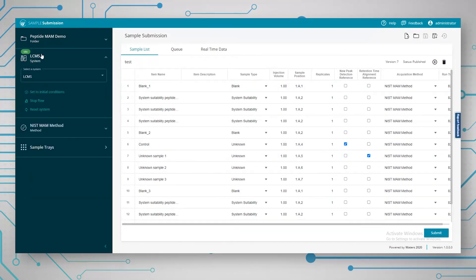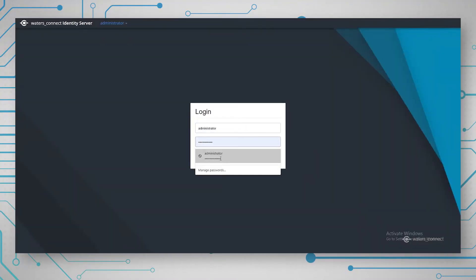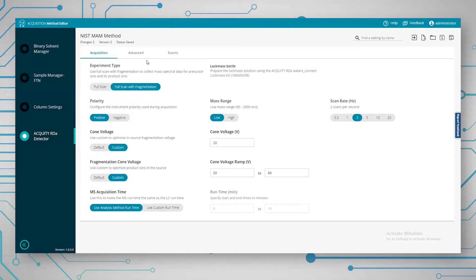On the left, we can interact with the system — our LCMS system is green and ready to use. We can set to initial conditions, setting the flow rate and column temperature, and we can stop the flow and reset the system. We can also go into the acquisition method editor, which is another app in Waters Connect. Here we can see parameters for the BSM, the sample manager, the column settings, and the mass spectrometer — all the mass spec parameters for a full scan of fragmentation acquisition, which is the standard peptide acquisition that we use. We can edit the method here or browse in another method.